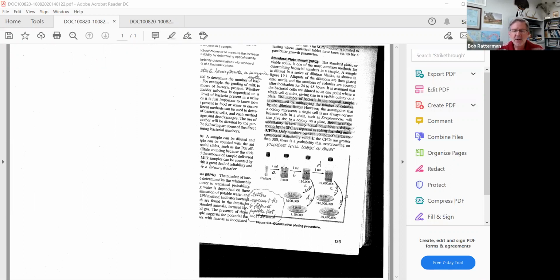And then they transferred, using a different pipette tip, a milliliter of this into a 99 mil sterile water blank. In other words, they did another 1 in 100 dilution. However, you see this says 1 in 10,000 because we did two 1 in 100s. That equals a 1 in 10,000. So this dilution factor is representing the original culture.